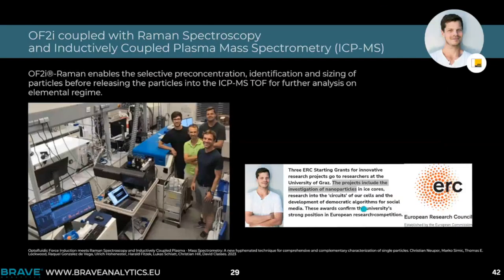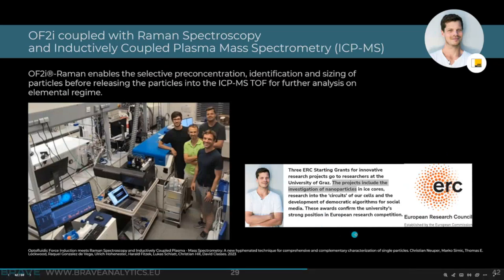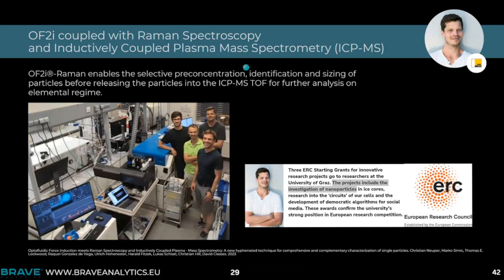We also do this with cooperation partners like the University of Graz, also funded by ERC, to really have all of this information on the Raman and the detecting of the particles and looking into the H particles, but also hyphenating this with ICP-MS TOF. So this is one of the next steps, working together with David Clases, that we connect.